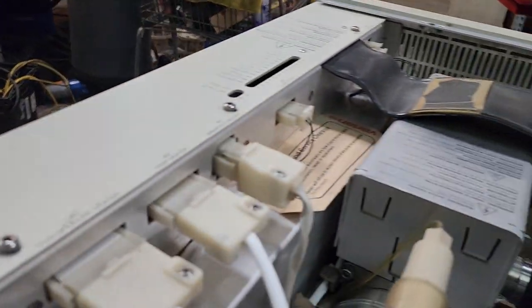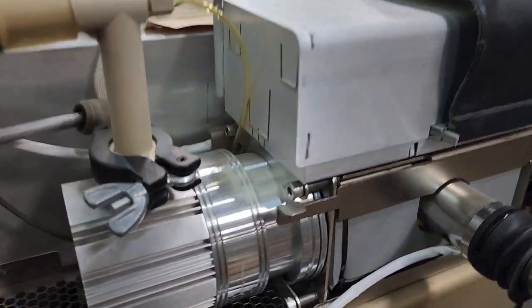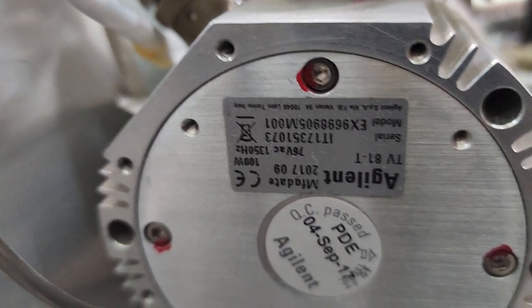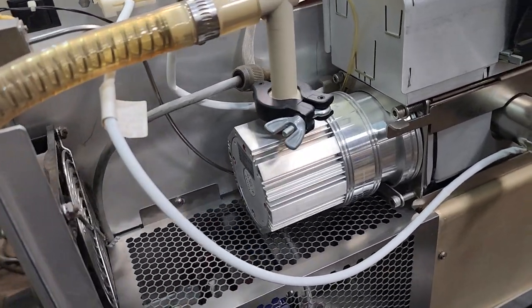I got this thing, the cover off, and it has an Agilent turbo molecular pump that's — wow — upside down and backwards. TV81. And when I powered this thing on, I kind of heard it running.